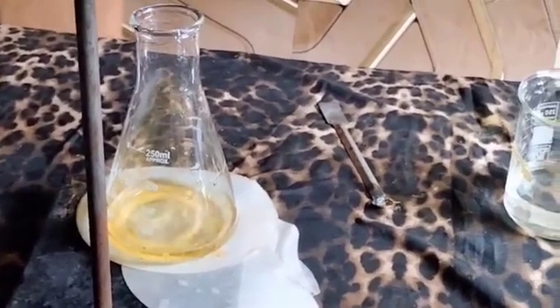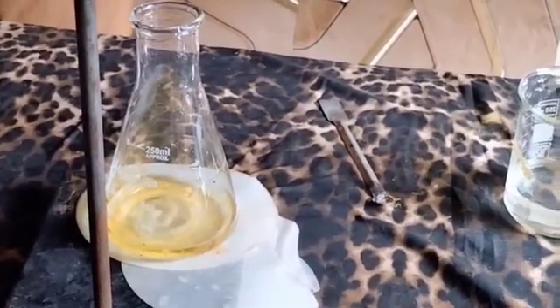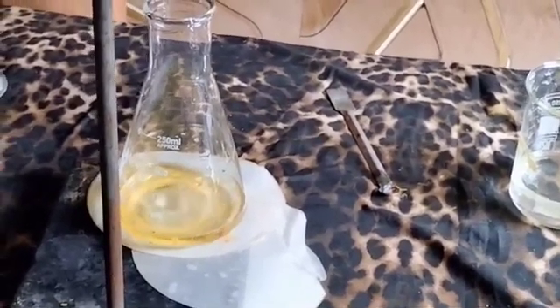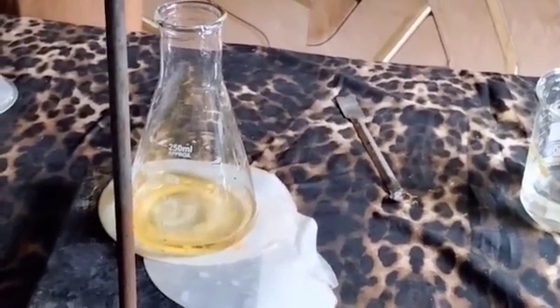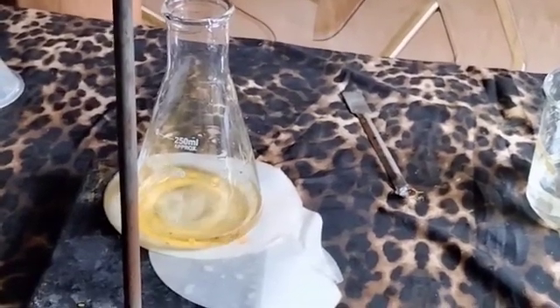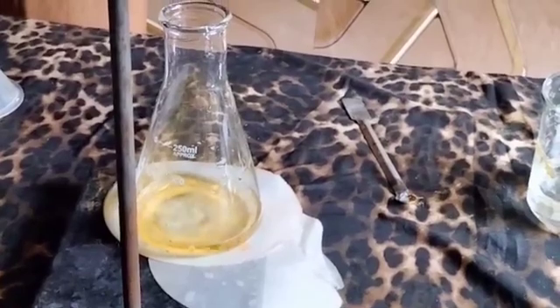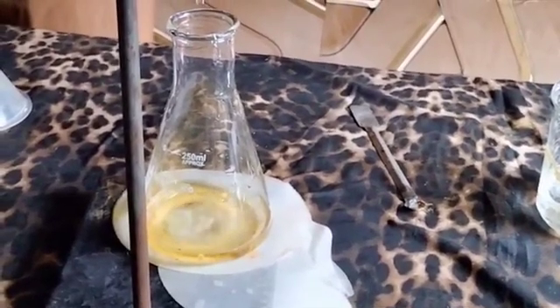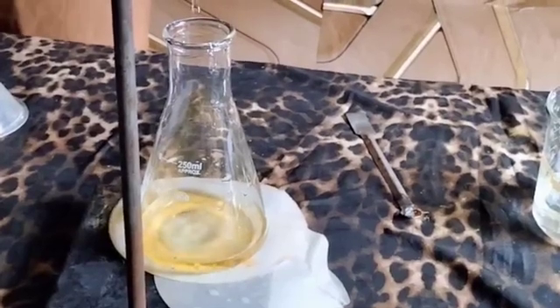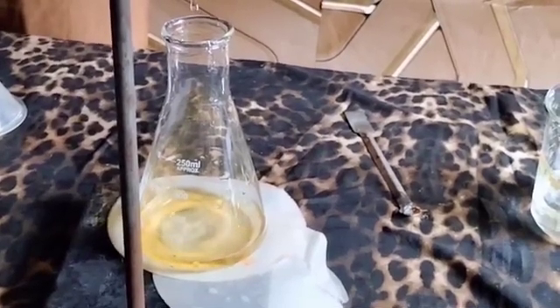As we said, you're still on the Best Science Brain YouTube channel, and this is the NECO 2024 specimen. Solution A contains 3.8 cm cube of H2SO4 acid. Solution B is 6 grams of anhydrous sodium carbonate. So that is the titration we're performing, trying to verify the accurate end point.